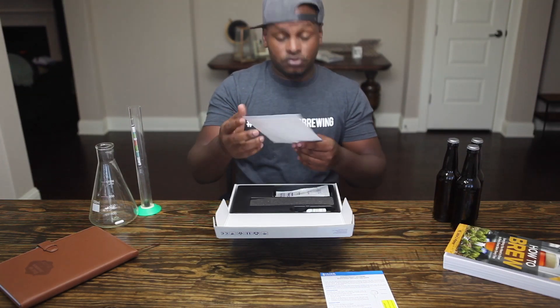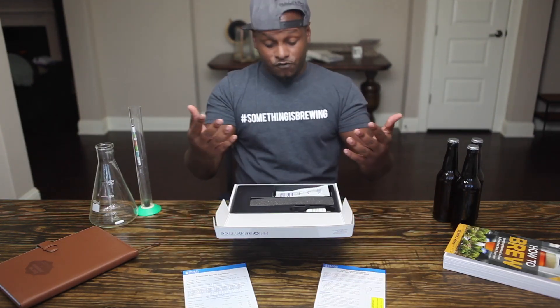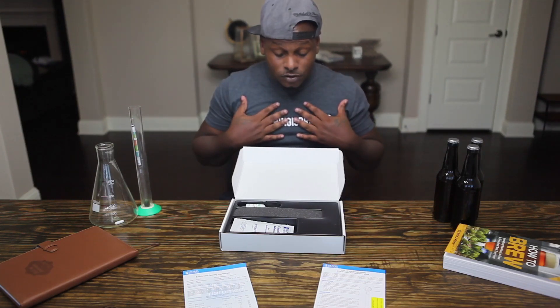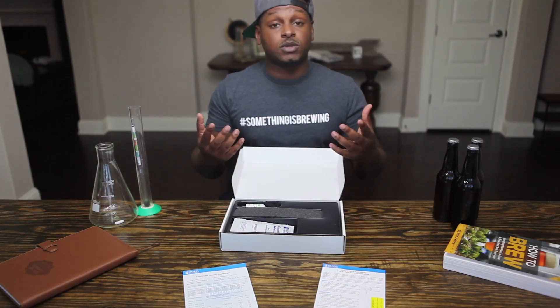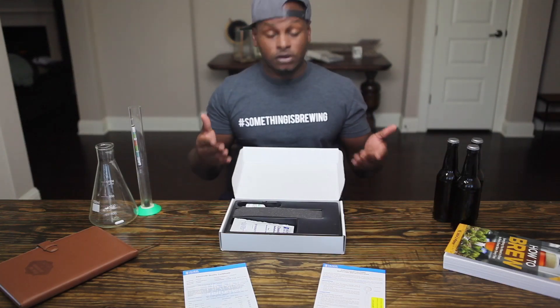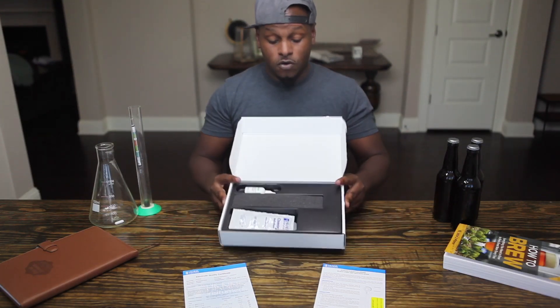They also did a water bath test to check if it's waterproof. According to their website, you can actually take pH readings up to 212°F. I'm not brave enough to do that myself, but I have taken pH readings during mash temps anywhere between 148°F and 158°F and I've been getting consistent readings, though I've only used this product twice on two beers so far.